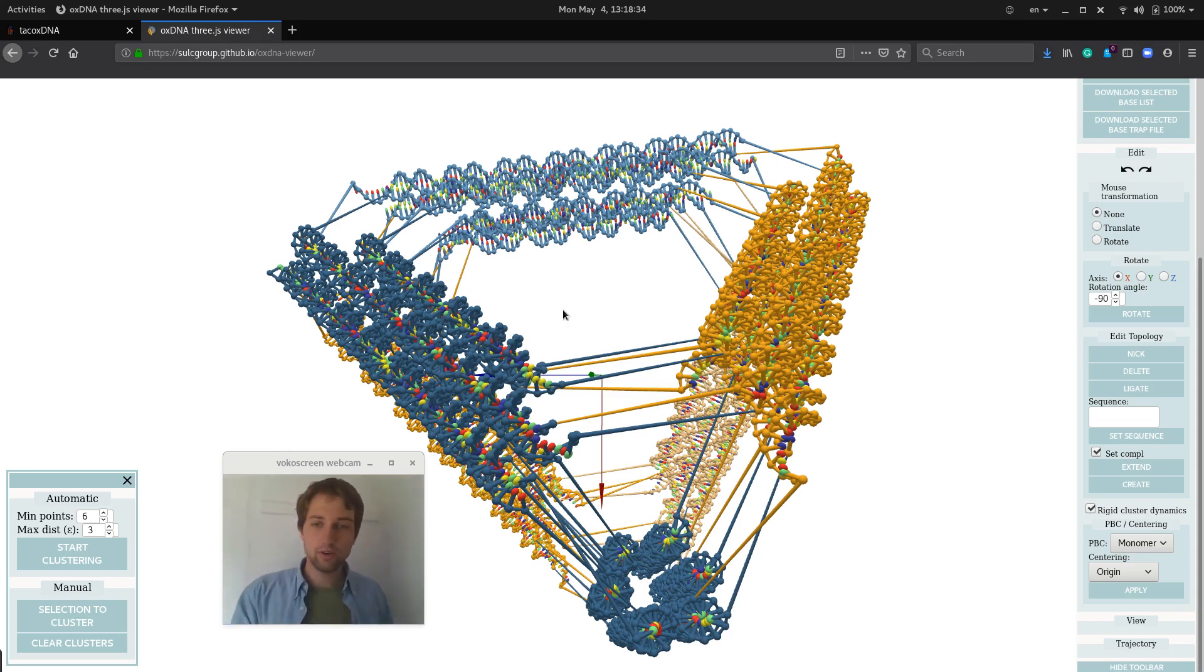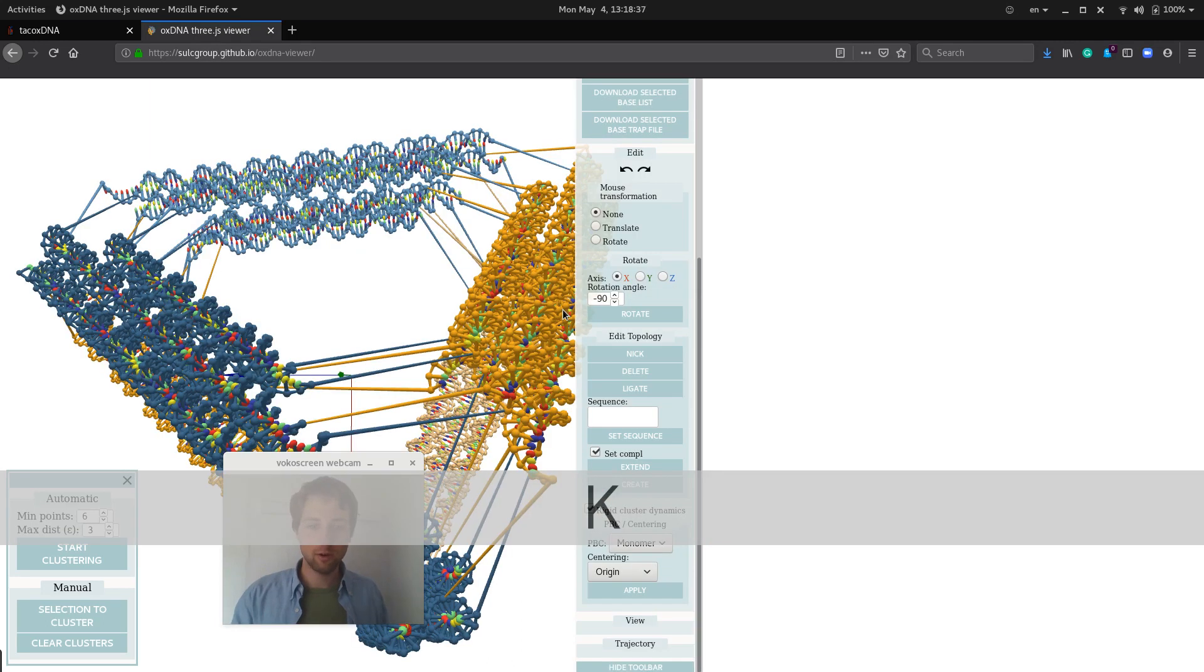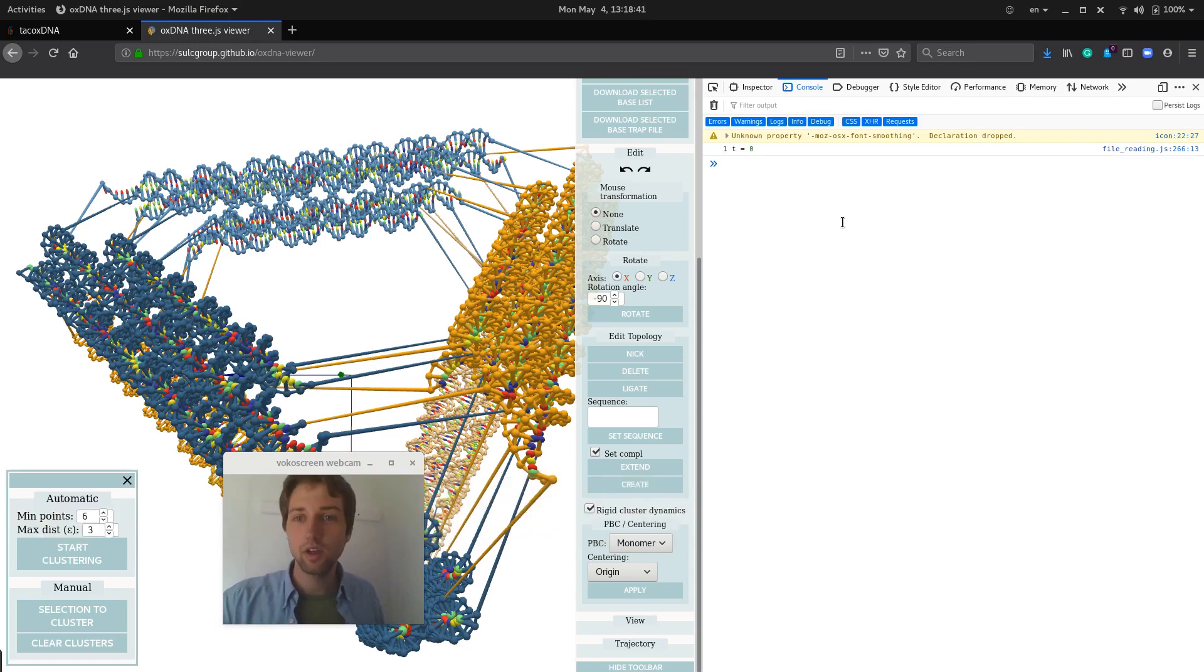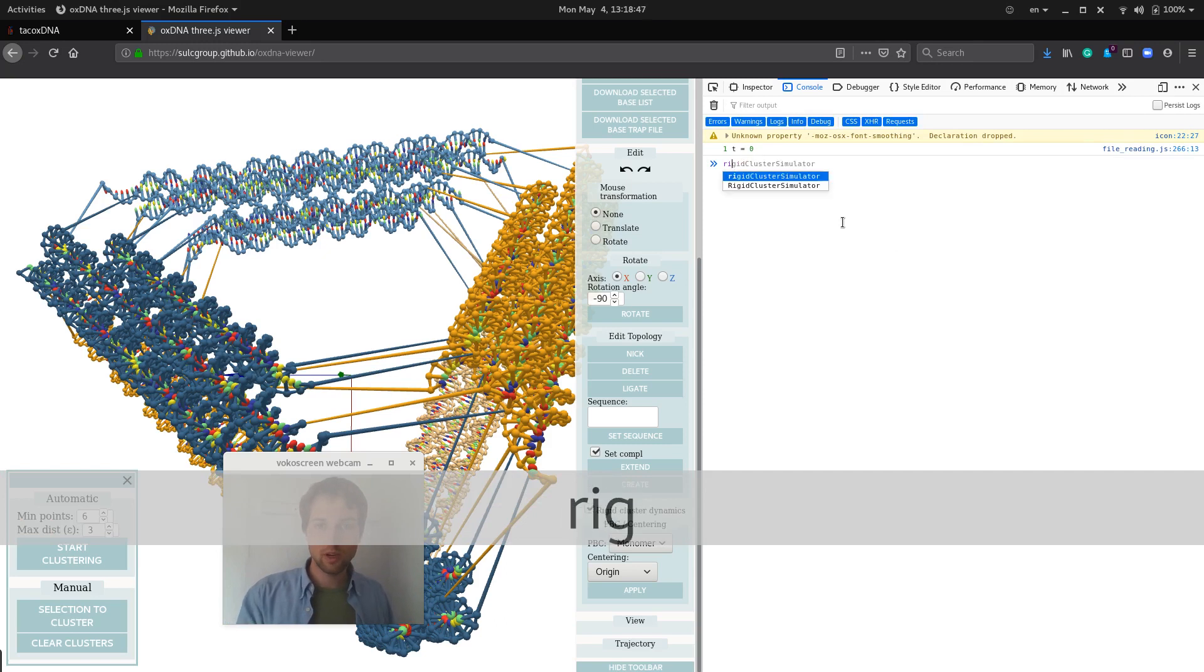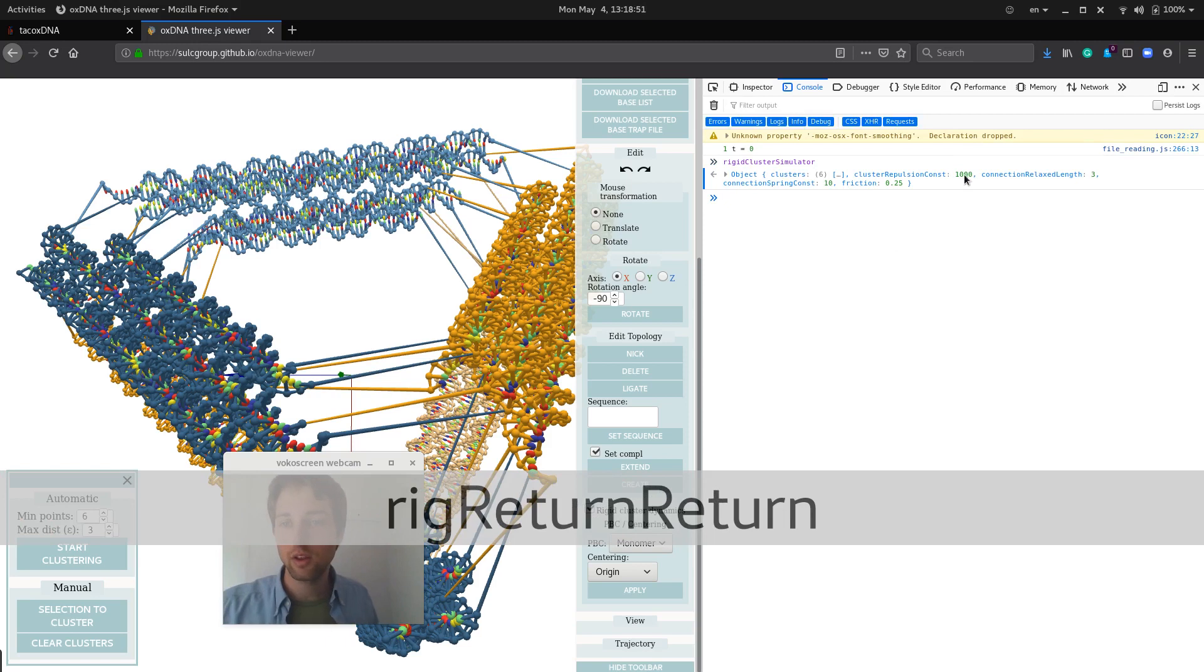But if you want to get them a little bit closer, we could actually go into the code with Ctrl-Shift-K on Firefox, which launches the web console. And then you do rigid cluster simulator, and here you have a list of the different constants that are implemented.